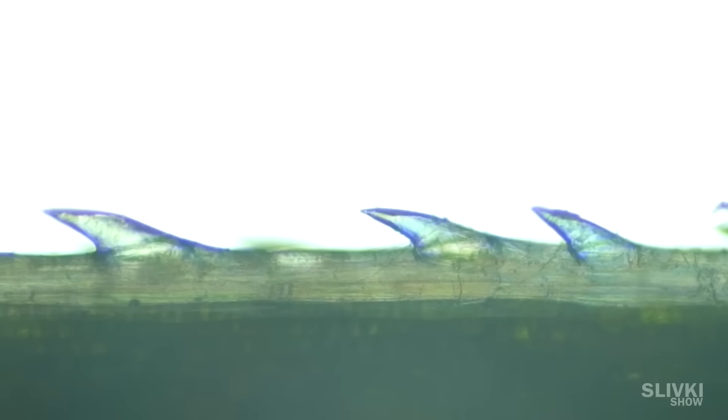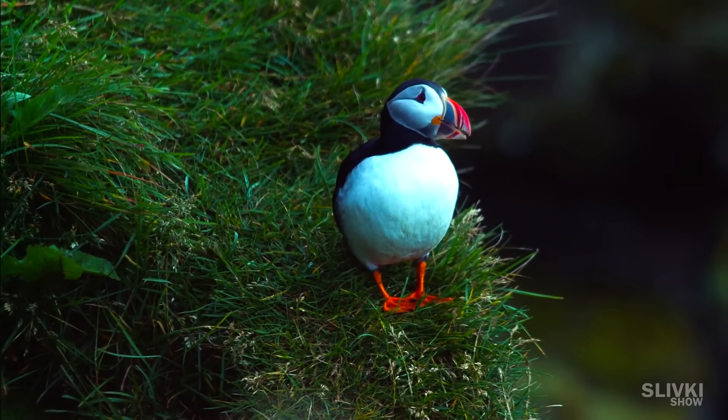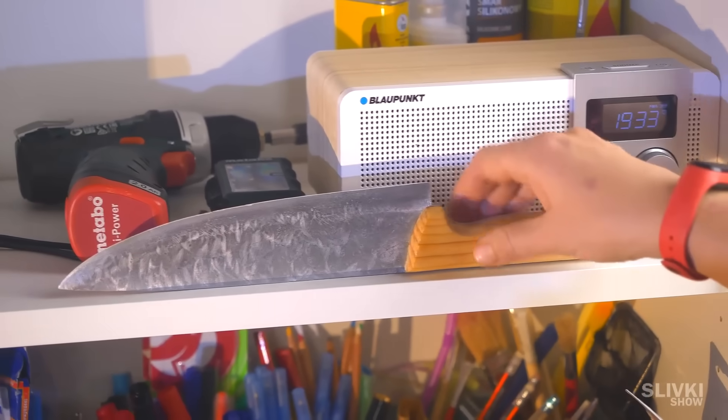But let's move to the edge of the blade of grass, turn on the light a bit and refocus. Amazing! You see the cogs on the edge of the grass? They are the ones that literally cut through a person's skin, sometimes creating quite deep cuts. Who would have thought that a harmless blade of grass can actually make a small saw?